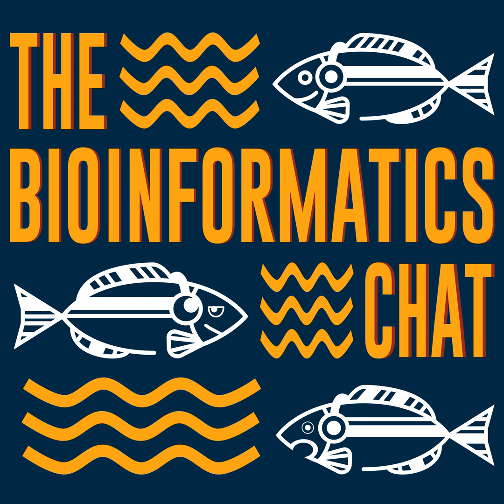And there are other technologies such as Hi-C. With Hi-C, you get pairs of reads that come from related regions of chromosomes. And if you have these pairs of reads that consistently align to a pair of contigs, then you can say that, okay, these contigs must be connected together in the genome. And you can use complementary sequencing technologies as well.